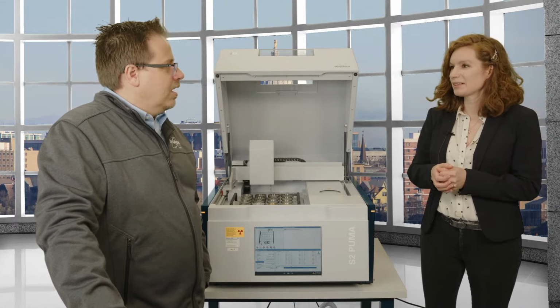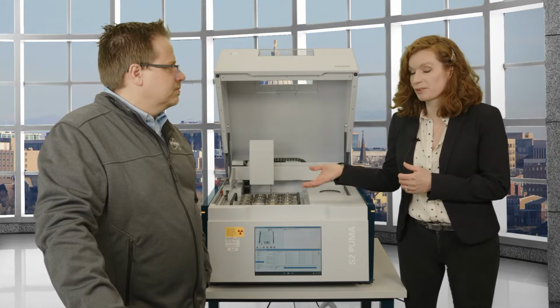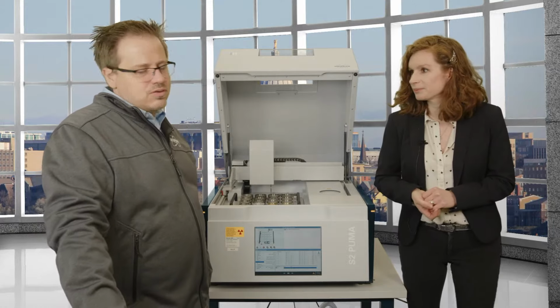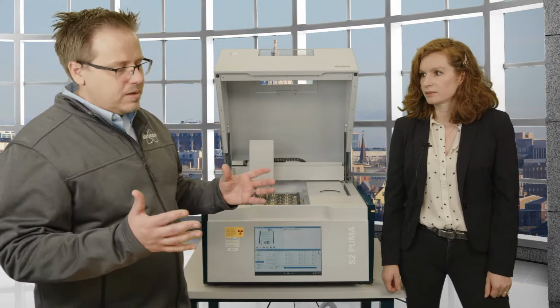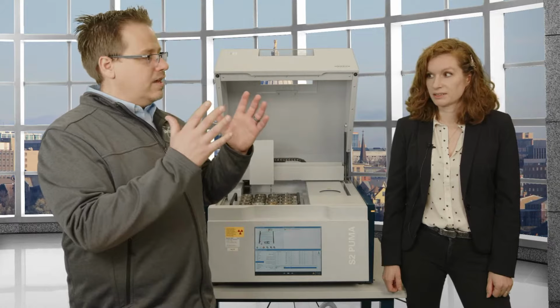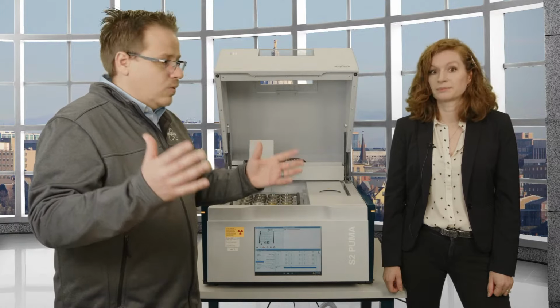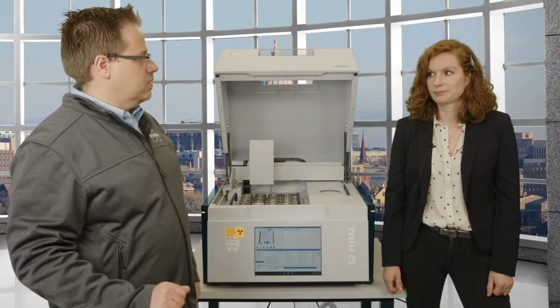I think battery is just starting up. We can't measure lithium. You will not find a commercially available XRF system that can measure lithium, but we can measure all of the other elements that are in it. And I think one thing that's really changing that is an industrial trend in analytical: it used to be that you had a specialist who had to run the machine, and because it was so expensive, it had special requirements for maintenance and rooms. It had to be at a special place. In the university, you might have one in one department. But nowadays these things are so easy, you can put them right next to your experiments, right next to the problem.